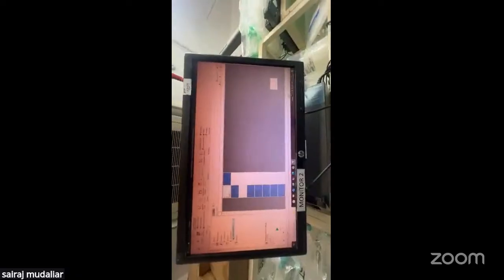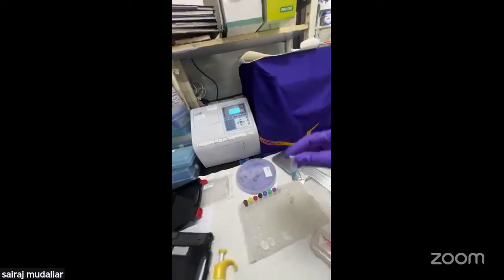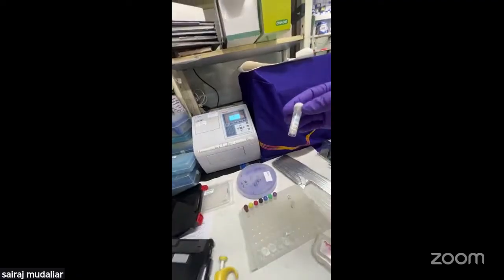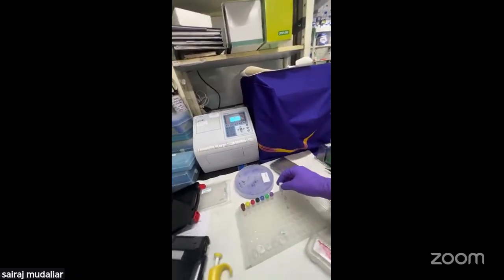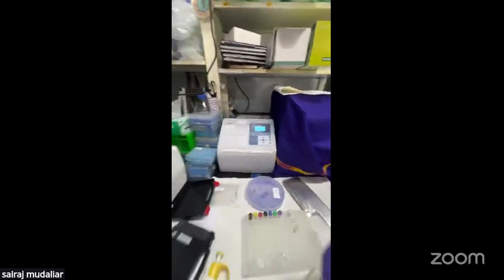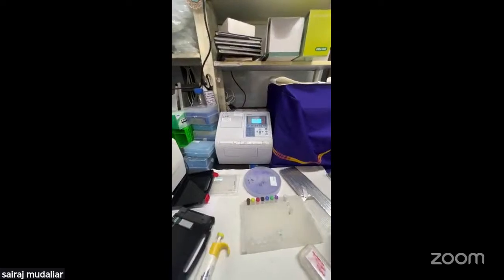Once the intensities are measured, we dry these peptide samples totally. Once the peptide samples are totally dried, we reconstitute in the LC loading buffer. One step we missed is that we can quantify the protein samples initially with the Bradford.